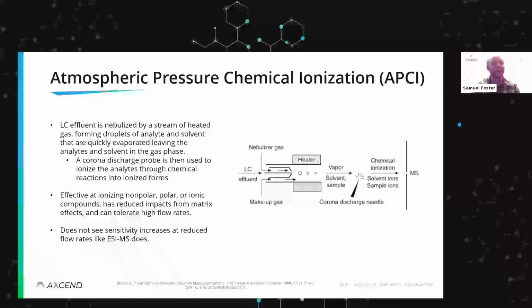Wow, ESI is winning with 100% of the vote. That's awesome. We'll give it another 1 or 2 seconds. It looks like ESI takes it with 100%. And that doesn't surprise me because electrospray ionization is incredibly common. And we will go over a little bit about why that is. But I want to mention some other aspects of it.